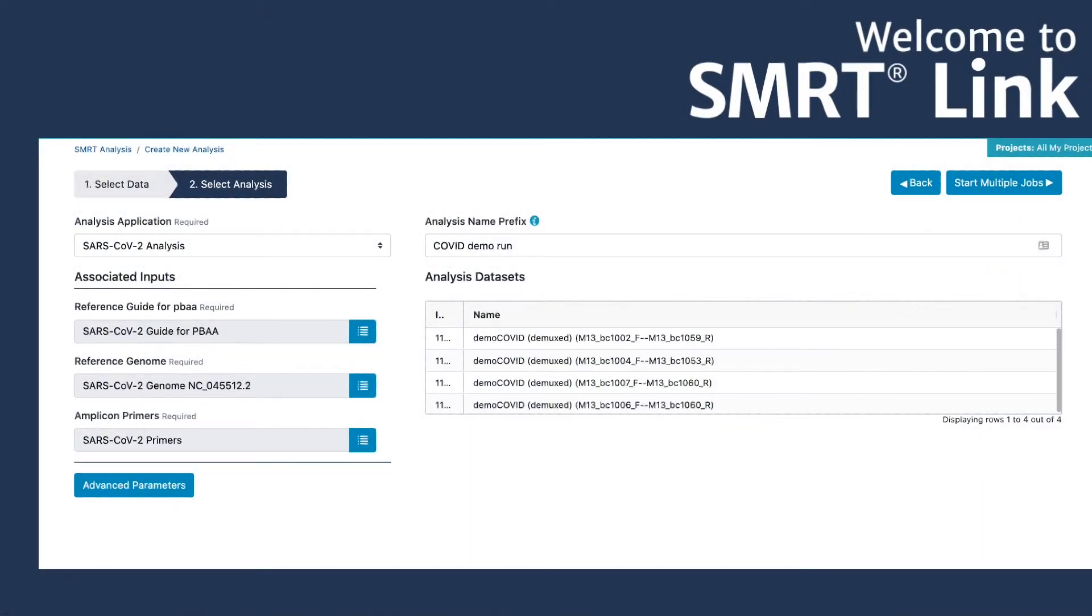The SARS-CoV-2 workflow in SmartLink supports analysis of multiplexed viral samples for COVID surveillance.